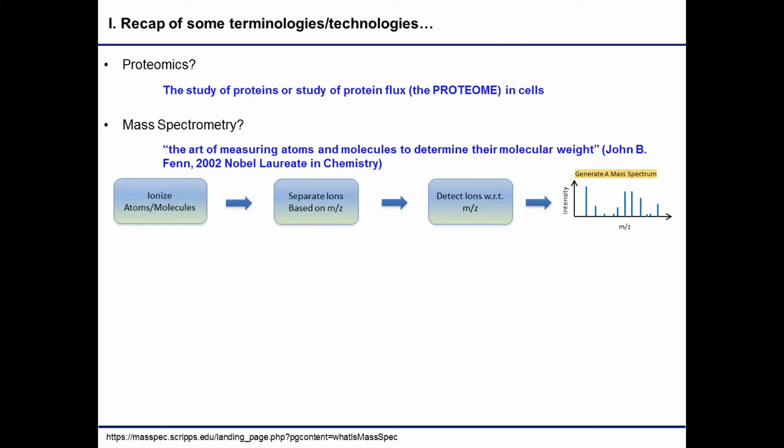whether it's a direct photoelectric effect based methodology, or an offline resistance change that you detect to see the oscillation changes of the ions, so that you can do a deconvolution to get the M over Z ions. So at the end, what we get is a mass spectrum.